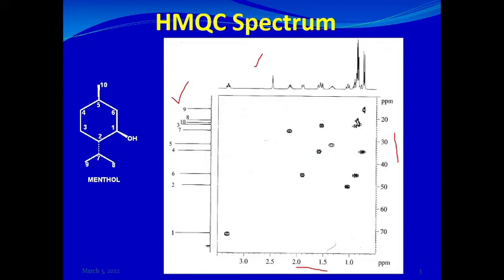Each of the contours you see in the spectrum shows a correlation between a proton and carbon. Remember, it is a one-bond hydrogen-carbon coupling, so it shows directly attached protons and carbons. Let's start with one contour and see how we can obtain information from it.